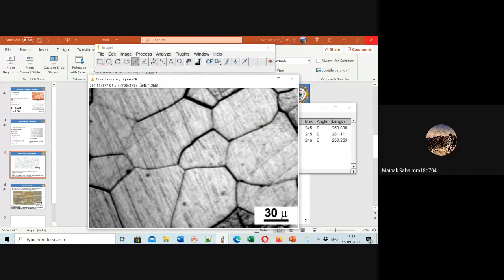Is it okay with you? Understood, right? Yes, sir, I understood. So the other thing I will tell you: when we get the length results, we put them in the formula and then we get the final answer, right? That's the classwork. That is the linear intercept.